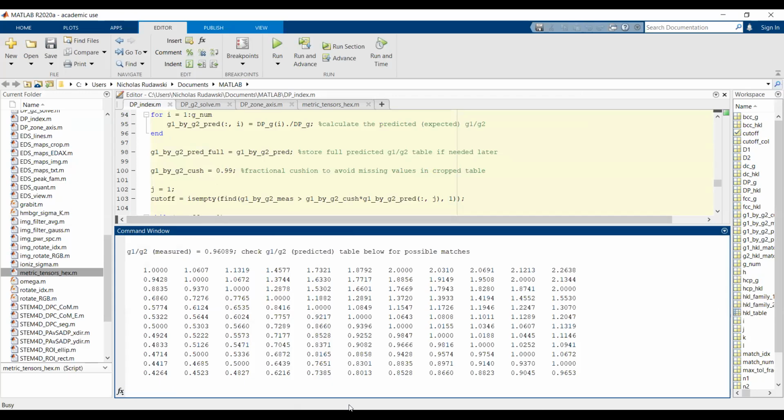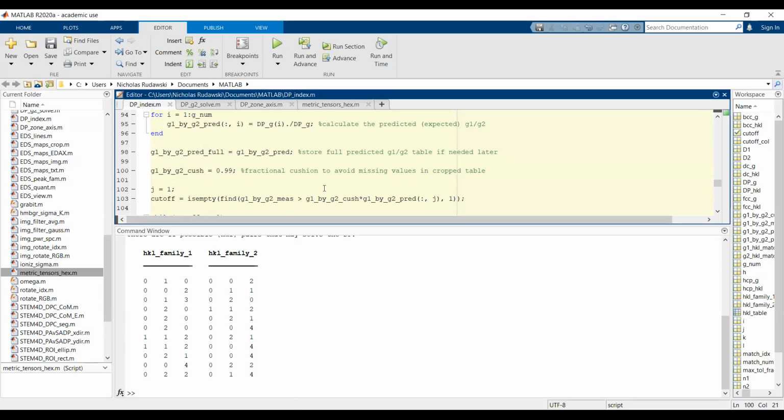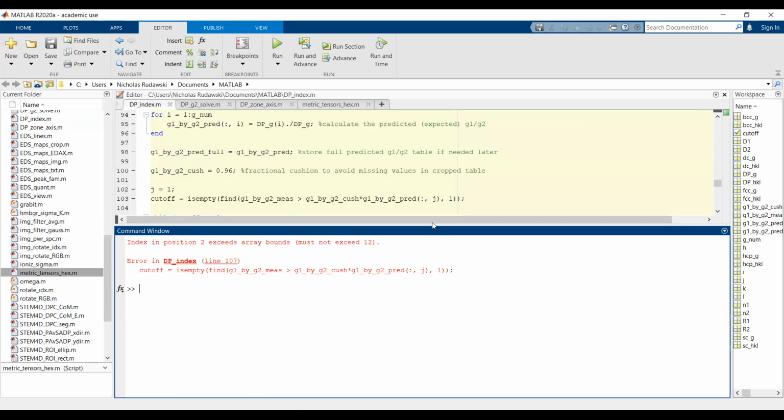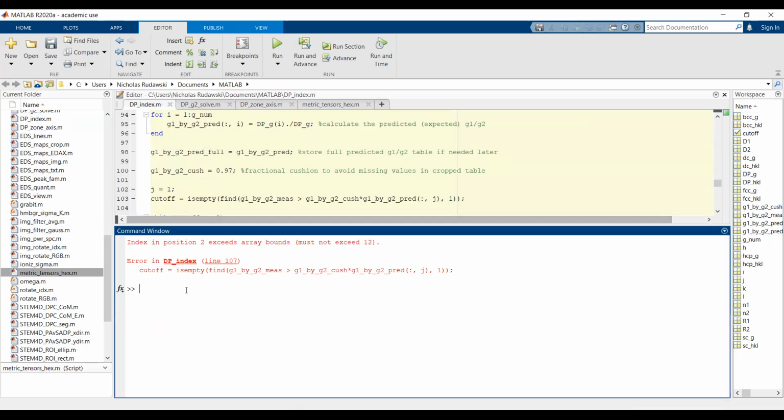May not, but no, it doesn't. It's basically giving us all of the diagonal terms. Let me see if I go a little bit the other way. No, so it's not doing that either. What about if I do 97?